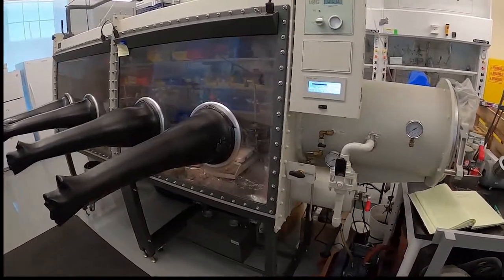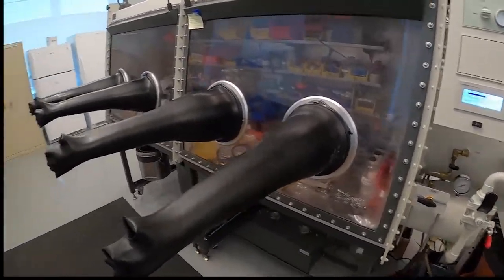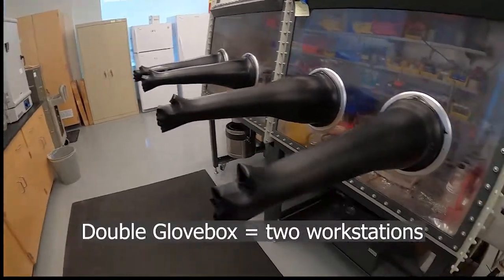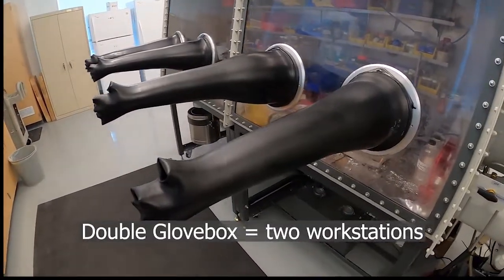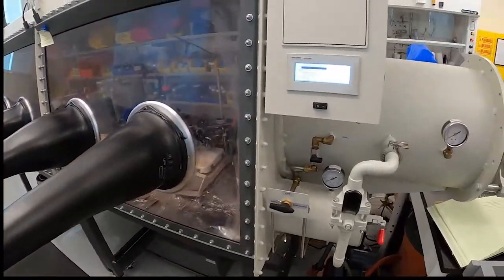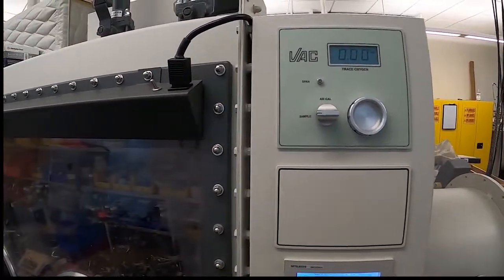Here's a quick look at the glove box in the hidden lab. You can see it's a double-station glove box — there are four gloves, so two people can work on it at a time. We also have a trace oxygen meter.